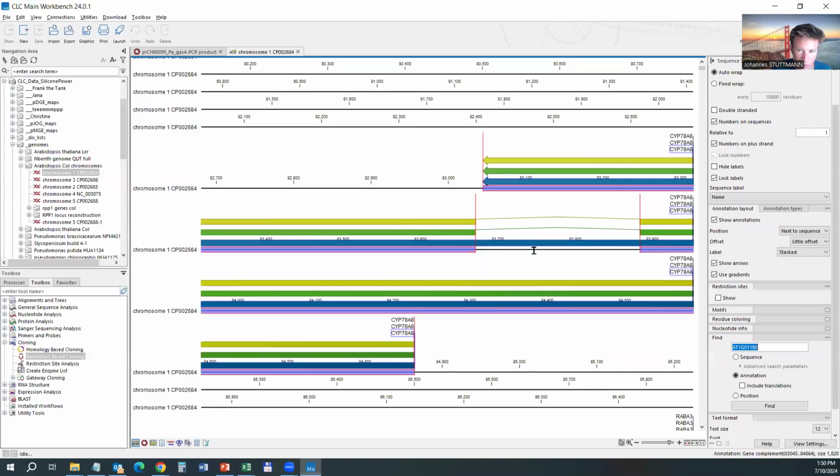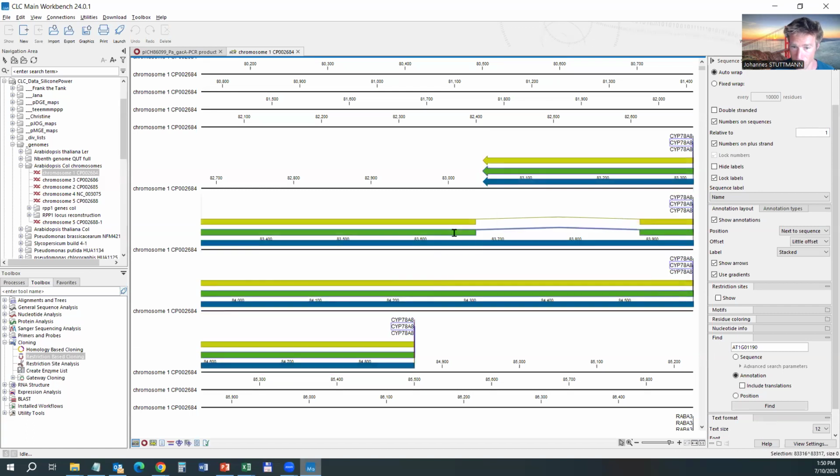So the only reason why I'm insisting on this is to just see the differences between these annotations. Blue is gene. It should normally also contain or encompass 5' and 3' UTRs. So maybe this gene doesn't have UTRs, or maybe they have simply not been properly detected. But the annotation gene, the blue arrow, is everything that is transcribed into the, well, unprocessed mRNA. Then there is splicing kicking in, and the result of splicing will be the green arrow.